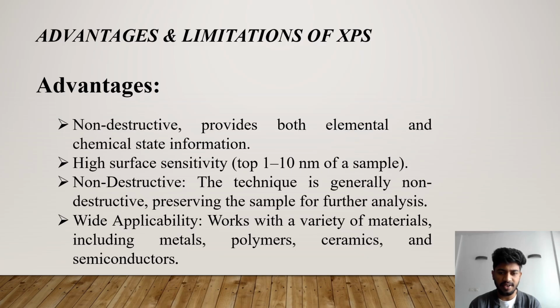The technique is generally non-destructive, preserving the sample for further analysis. Wide applicability is one of the best advantages of XPS. It works with a variety of materials including metals, polymers, ceramics and semiconductors.